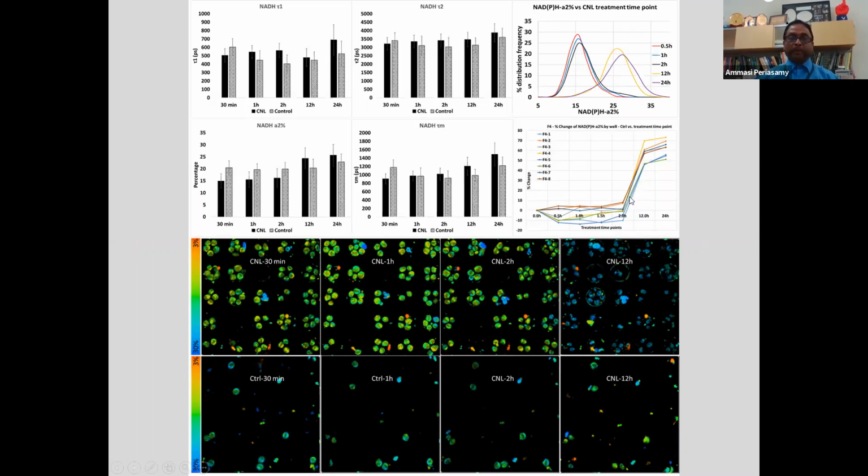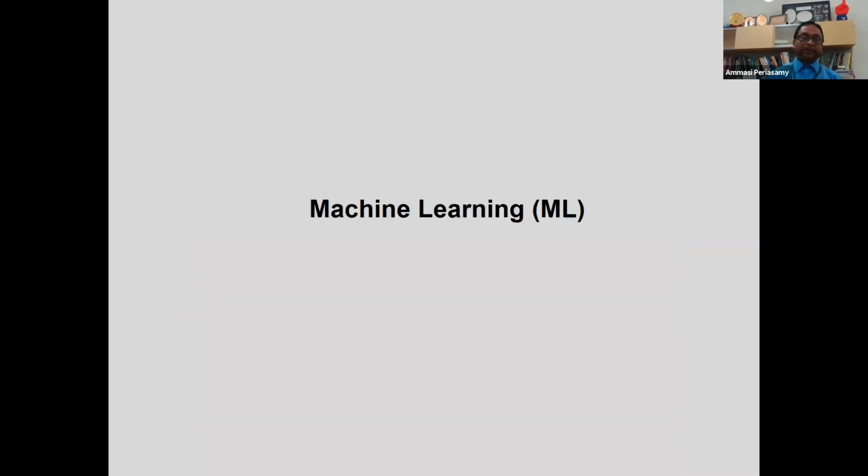Of course, all the approach is the same FLIRR approach we use to estimate that. So here you see that number of cells are there in each well. We would like to go for a single cell. So we are currently working on how we can improve the microfluidic array to trap only a single cell so that we are able to see the response of the drug from the single cell.